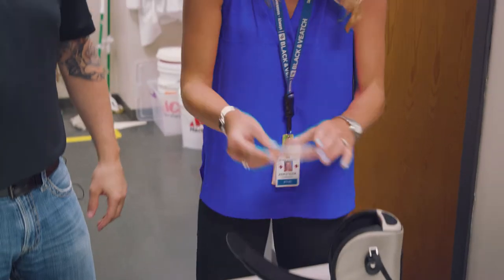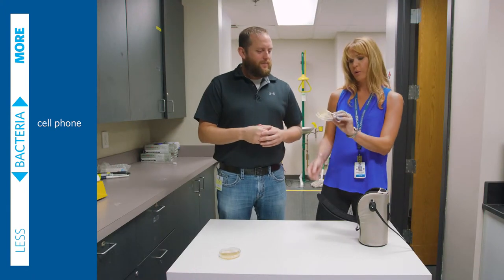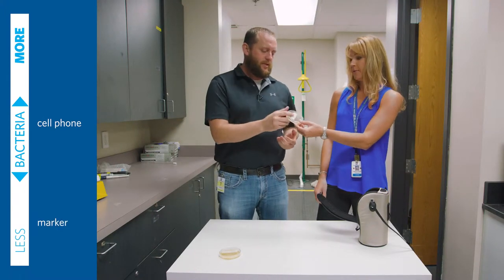We have the cell phone first. It's got some drops on it, some bacteria. The whiteboard marker, really clean. Yeah, it's almost like there's not even anything there.